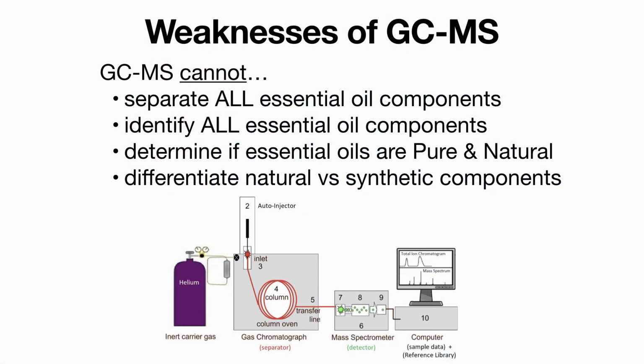Well, there are weaknesses to the GCMS as well. The GCMS cannot separate all the essential oil components. Sometimes two of them line up together. The GCMS can also not identify every single essential oil component. Some of them are not listed in the reference library.